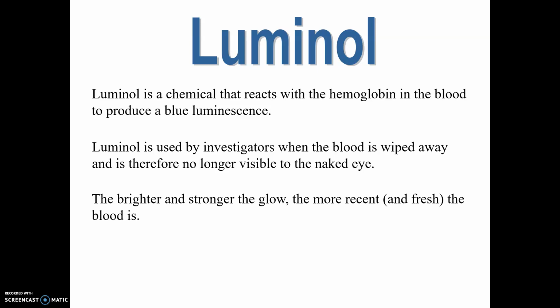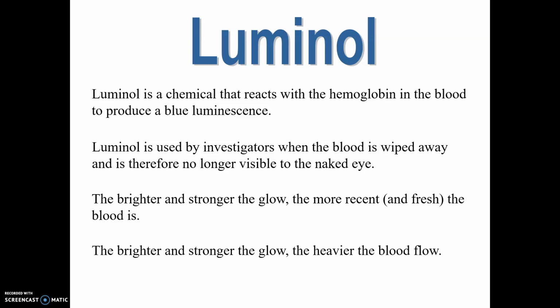And the thing that's really great about luminol is the brighter and stronger the glow, that means the blood that's at the scene is fresher, as opposed to maybe old dried up blood at the scene. It will tell you that whatever crime was committed was just recently committed. And the other thing is, the brighter and stronger the glow, then that means the heavier the blood flow. So it can also give you an idea of the amount of blood that is present at a crime scene. Obviously, it's not going to be quantitative, but it's definitely going to be qualitative. Okay, you should be able to find out a lot of information based on what you see at a crime scene.